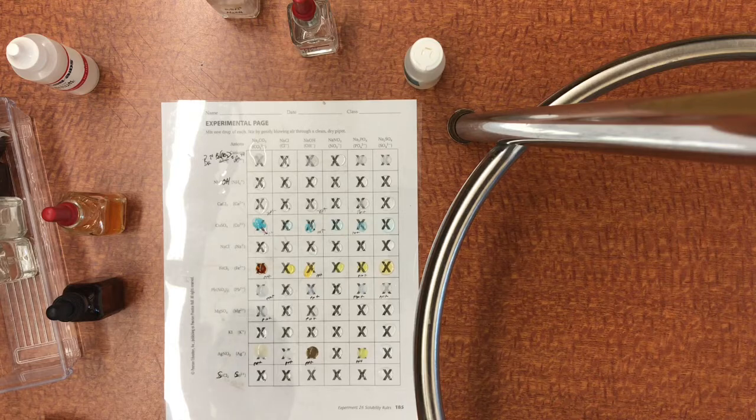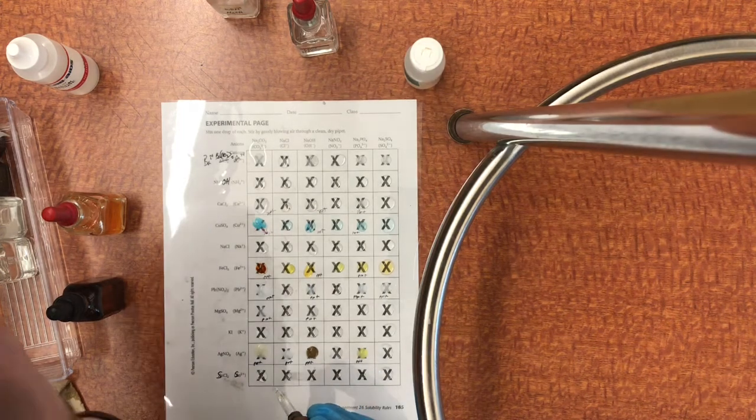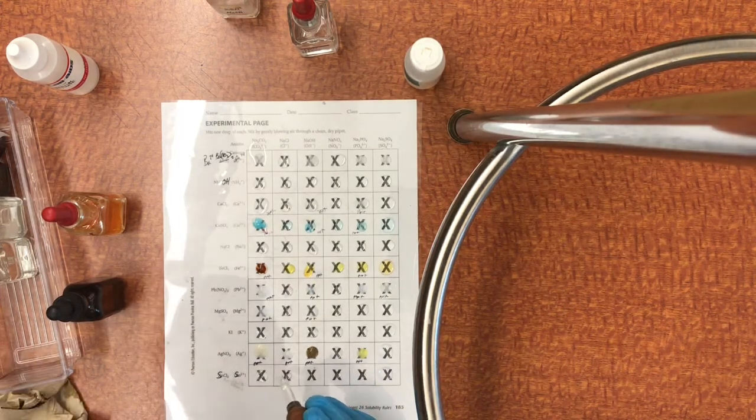Okay, I did not have the zinc chloride that it requested, but I do have some tin chloride, so I thought that might be interesting. So there is something happening. Bubbles. That's weird. Okay, and then there's another one. No reaction.